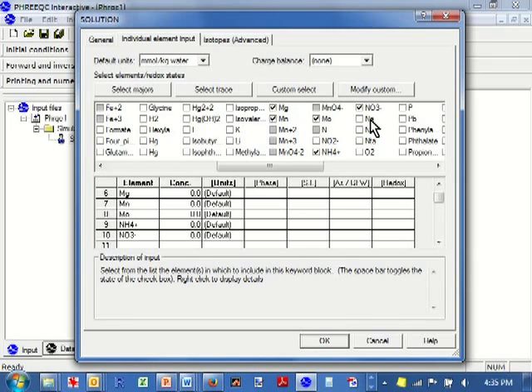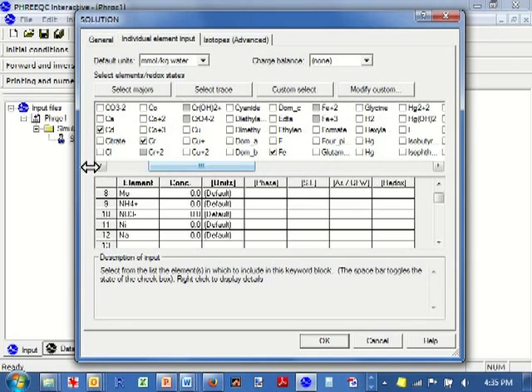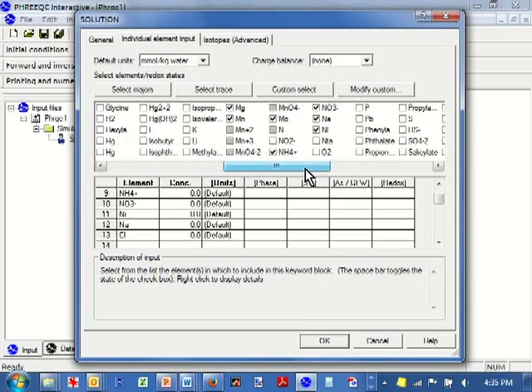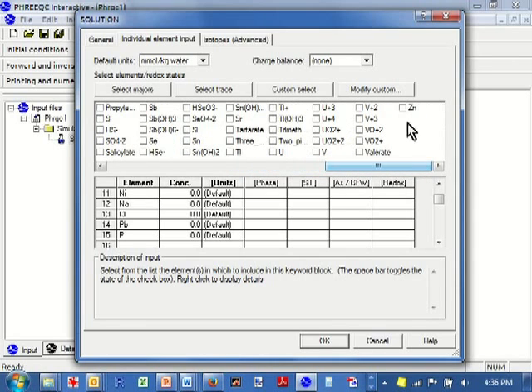We have data for nickel. I'm going to put in sodium because we've got a measurement of salinity, and in that case I should probably put in chloride as well. And we have lead, and we have phosphorus, and the last thing we have is zinc.